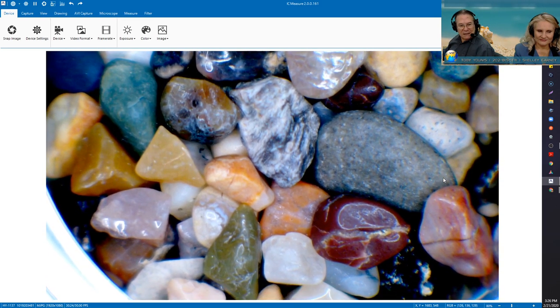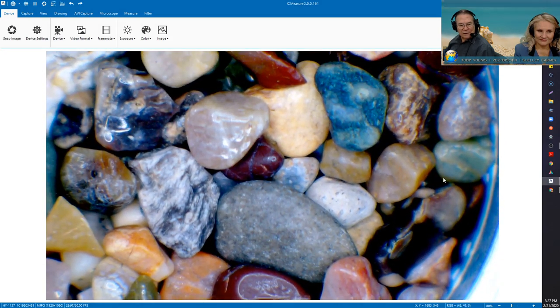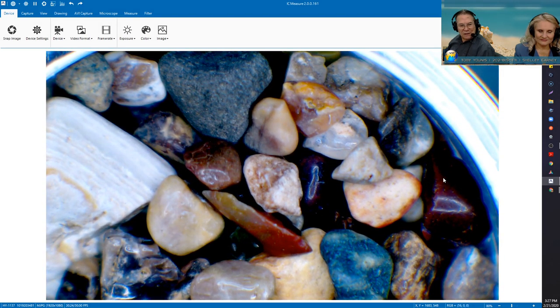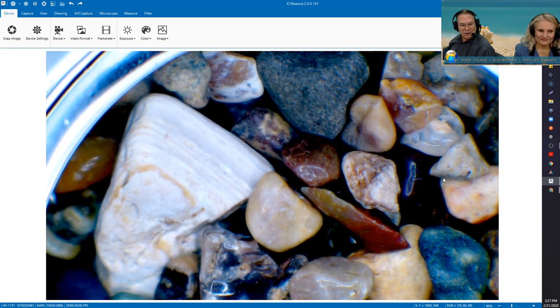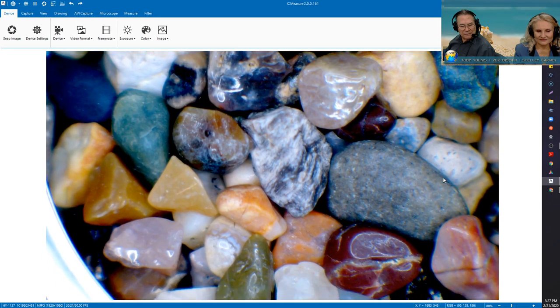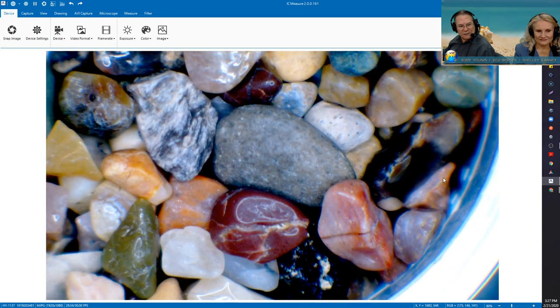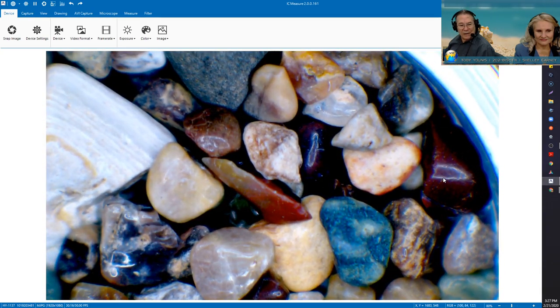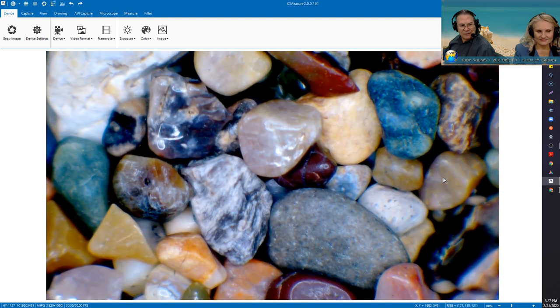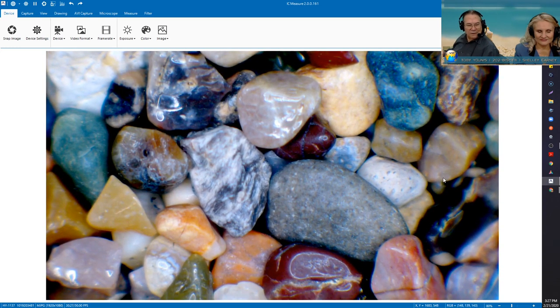I was really surprised at how little quartz there is in comparison to other seashore samples that we've seen, which tend to be predominantly shell followed by quartz. This one has neither of those. It is predominantly rocks with some shell in it, even the bigger sample of the two. So, a real interesting location, very different from what we've seen in other California coast pictures. And if you want, you can go back to our web albums and see some of those other samples, which are primarily shell, with a little bit of fish poop in the form of what was formerly coral as consumed by the parrotfish and then deposited back onto the seafloor. So pretty different. Let me put the smaller of the two samples.